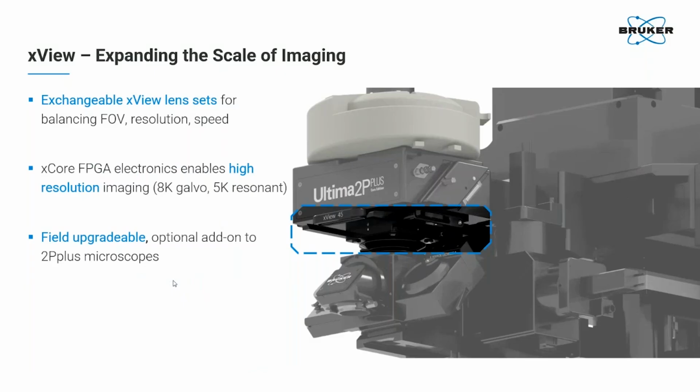Like I mentioned, like many of our developments, it's field upgradable. It's an optional add-on to the 2P+, and so you don't need to purchase it right away. But if your experiment calls for it later on, we can definitely add it on.